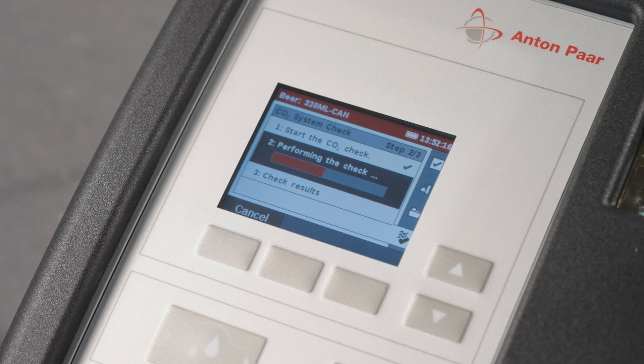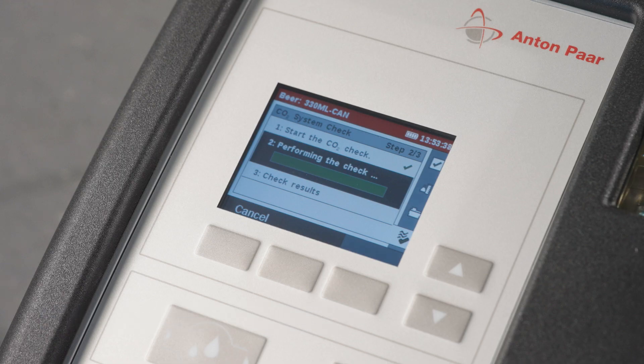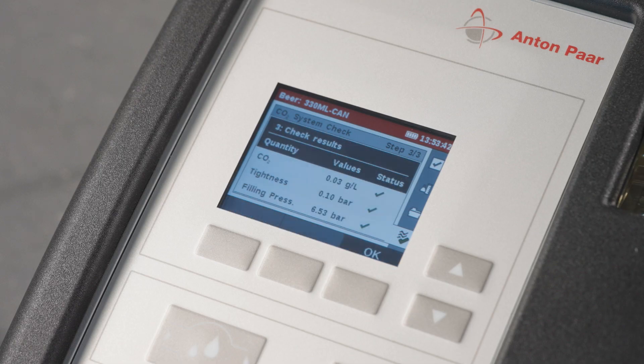If you are using the instrument standalone, connect the instrument to a CO2-free, chlorine-free process water line. Precondition the instrument first with one measurement, then open the CO2 system check and follow the guided wizard.